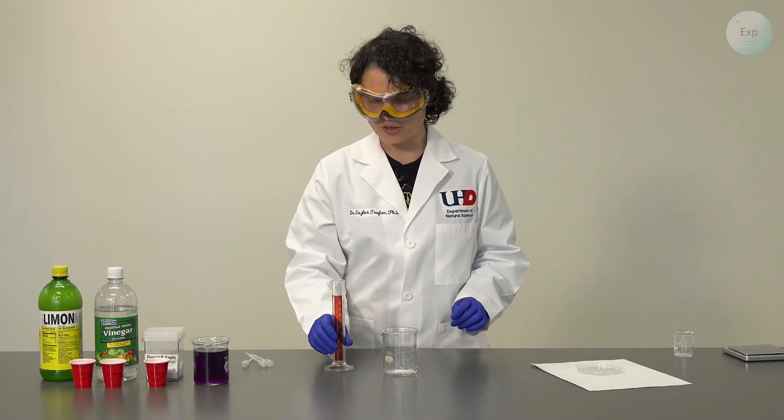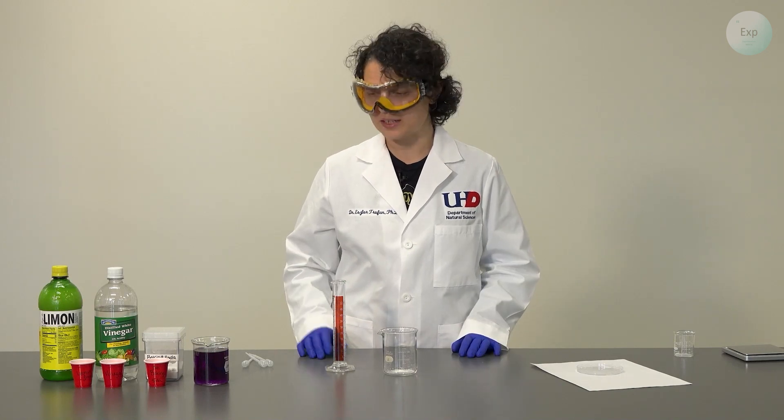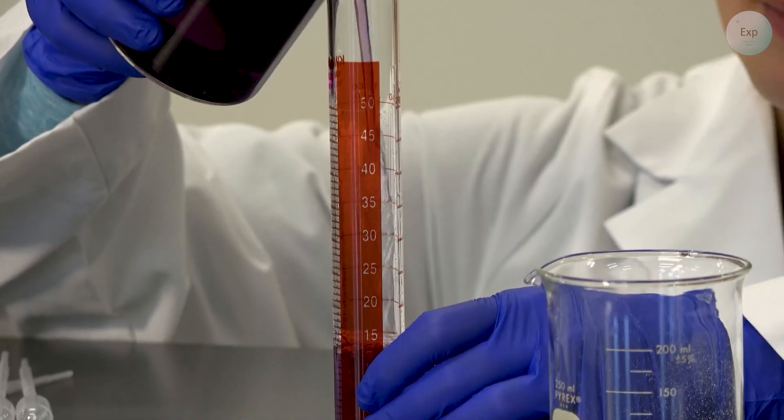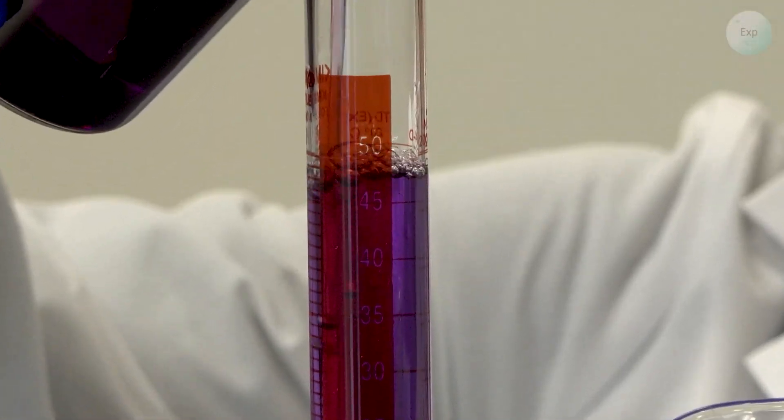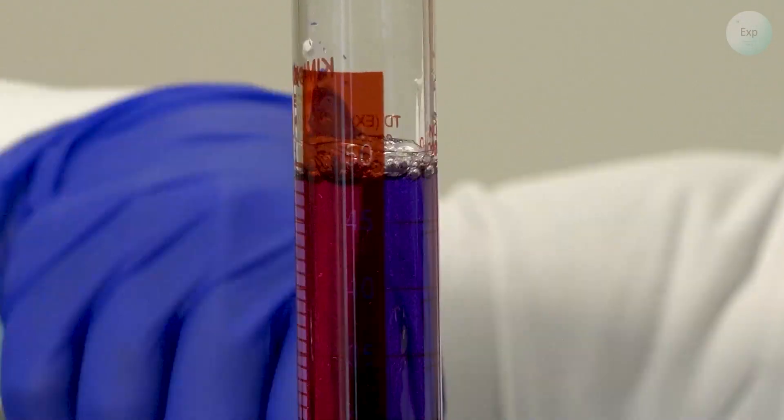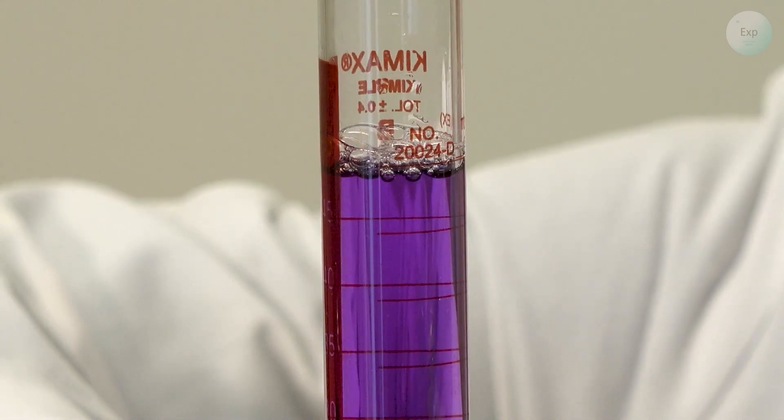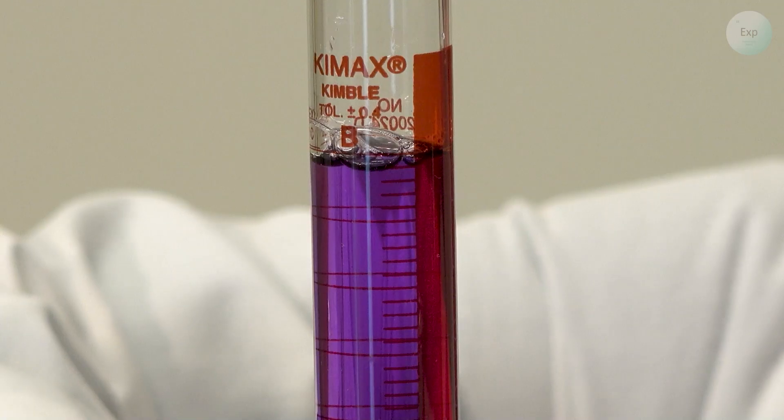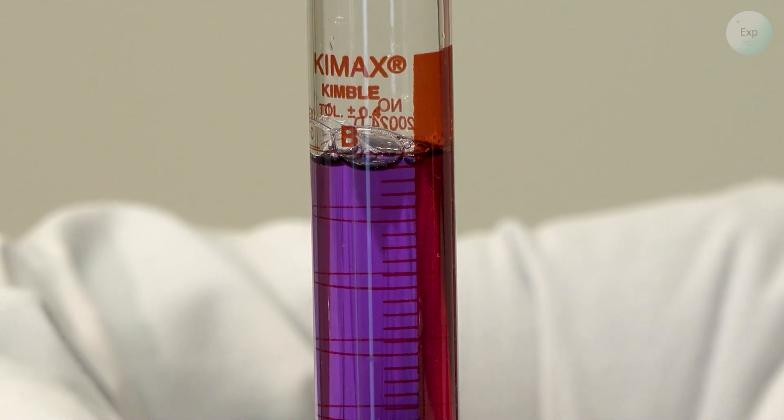Next I am going to measure approximately 50 milliliters of the indicator solution. And if there are bubbles, we have to wait for them to dissipate. We have 49.0 milliliters of indicator solution.